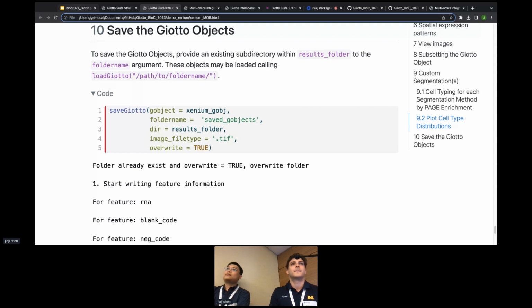So what about sf and terra? sf and terra are newer generation ways of dealing with this data, updates from raster and sp, right? Terra is just one of the newer ones that were on the field essentially, and we also found some pretty good benchmarks as to how fast it could process. So that's what we started with.